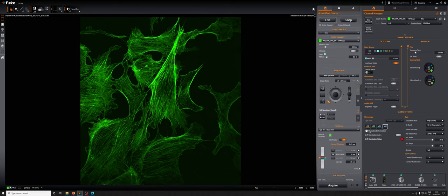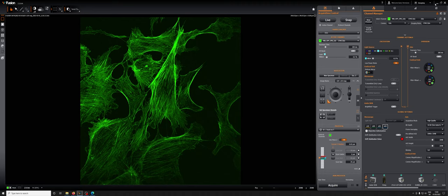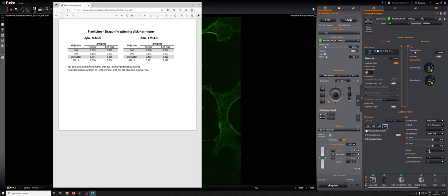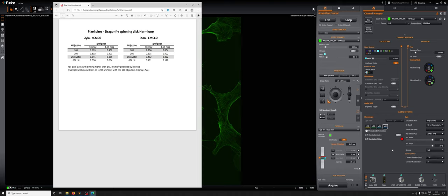The combination of the different objectives and the different magnifications give many different options for pixel sizes, and those options are in this document which lives on the desktop of this computer. You can see you can really select quite a variety of pixel sizes, and if you add binning onto this, which is this setting where you can group together pixels, there's another layer of complexity in terms of what those pixel sizes can be.